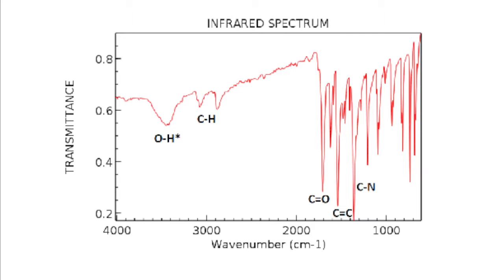We moved on to the next peak and identified it as a CH bond, with a range of about 2,850 to 3,000, exactly what was expected for a CH bond. The next peak chosen was in the 1,700 to 1,750 range, which most closely matched with a carbon double bonded to an oxygen. This has a range of about 1,650 to 1,820.